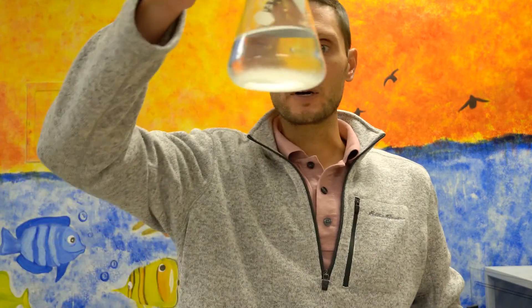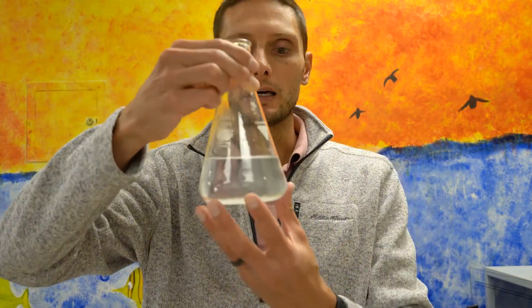Today in our surface area to volume lab, we're going to use this color-change reaction as a way to measure diffusion in a model cell. To make our model cell, we're going to use a compound called agarose. Agarose comes in powder form — it's actually made from seaweed — and when you add it to distilled water it creates a cloudy mixture.